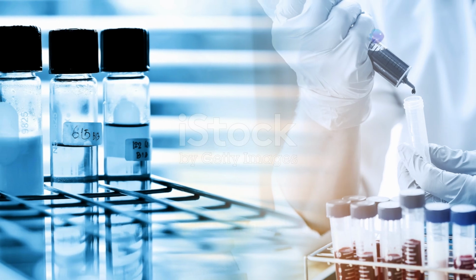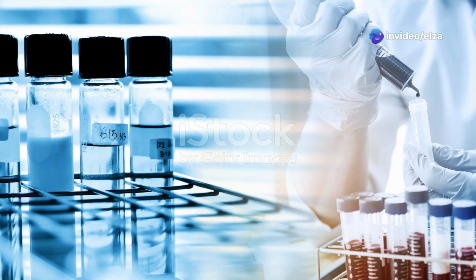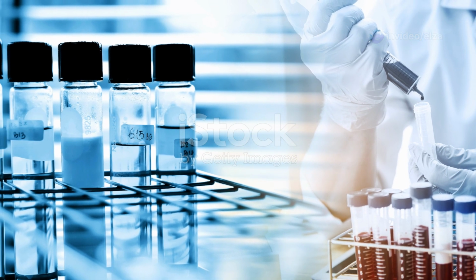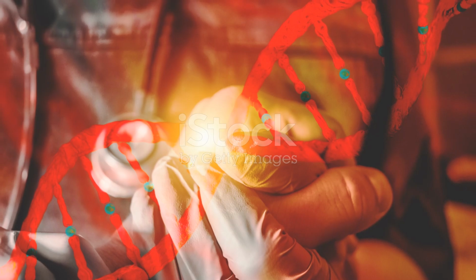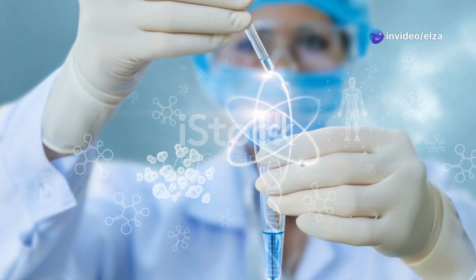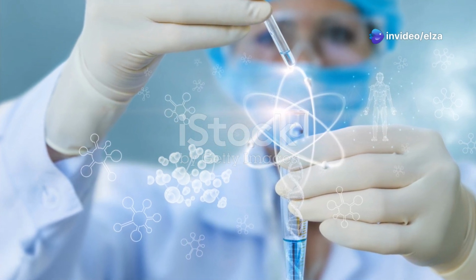Like any scientific technique, autoradiography comes with its own set of advantages and limitations. First, high sensitivity. Autoradiography is highly sensitive, allowing the detection of even minute amounts of radioactive substances. This sensitivity makes it ideal for studying processes involving low concentrations of molecules.